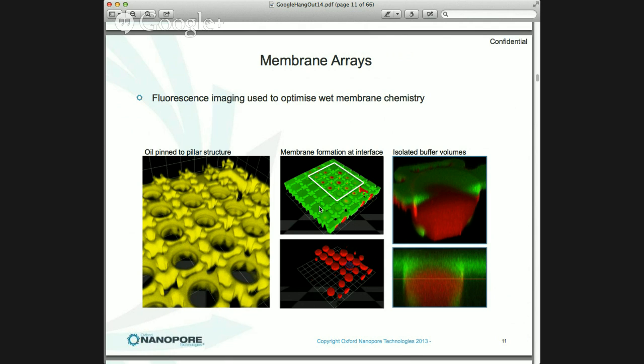And the system is designed through the use of surface tension and viscosity and other physical parameters, and the shape of the patterning is designed such that those reagents self-organize and separate out on the surface, such that we get water in the well, as shown here. Here's the electrode. And on top, we get a thinned out membrane of that special material. And here it is in section. And the pore will then insert in the thinned out section, which might only be a few nanometers thick.